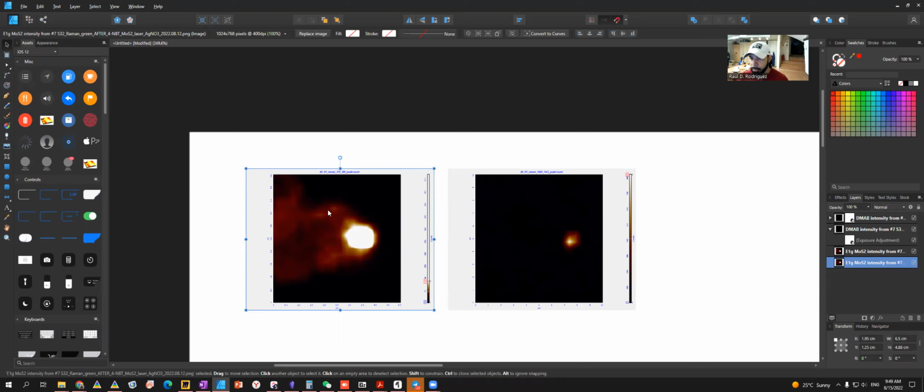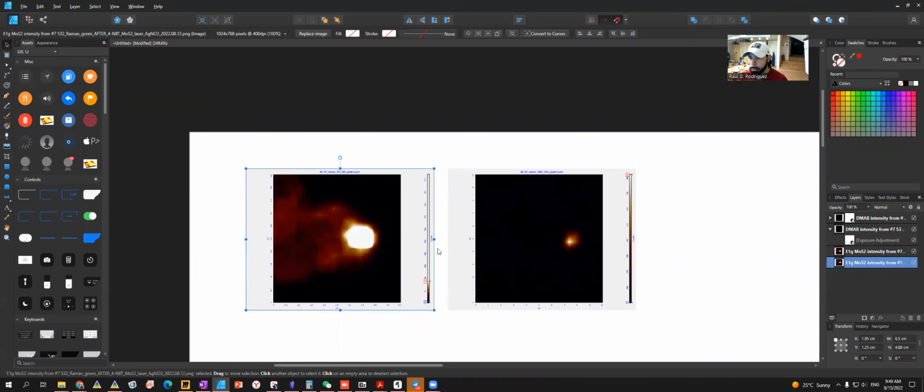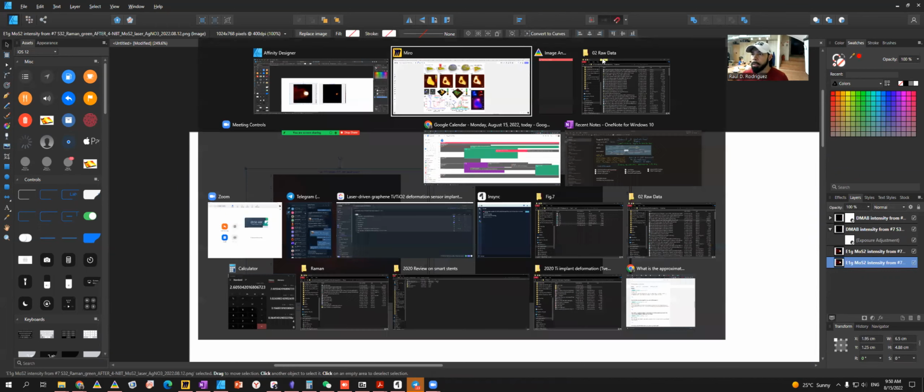Either I can edit the figure already, or I can crop all the sides and put the scale bars and color bars, recolor, play with the contrast, play with the color, make it nice. Yeah, I think I will start with this one. So I need to do all these things, and in which order, that's an important question.